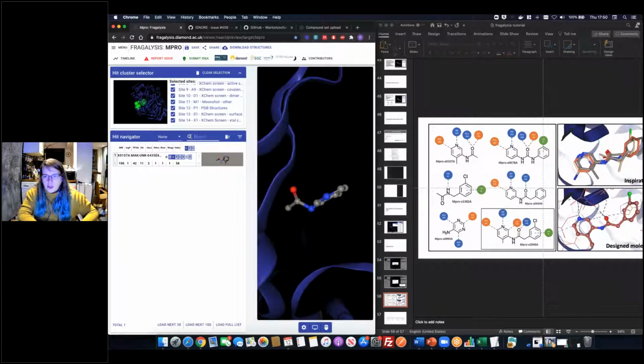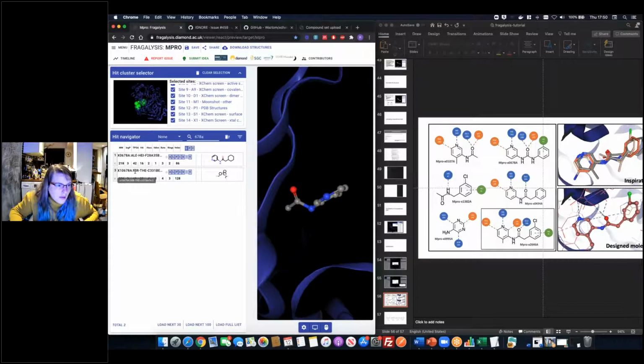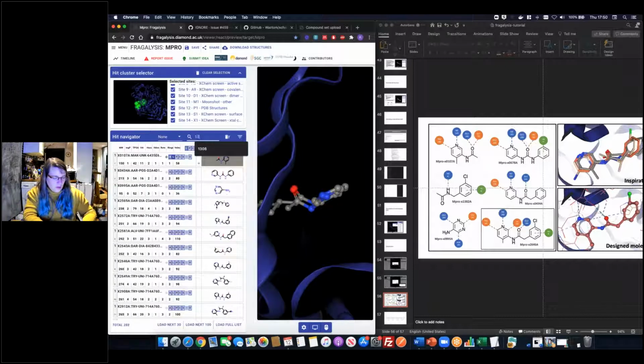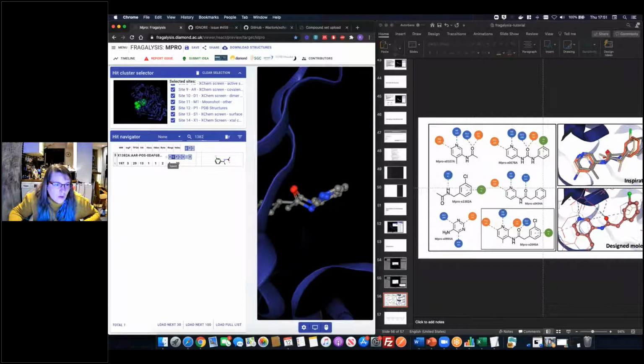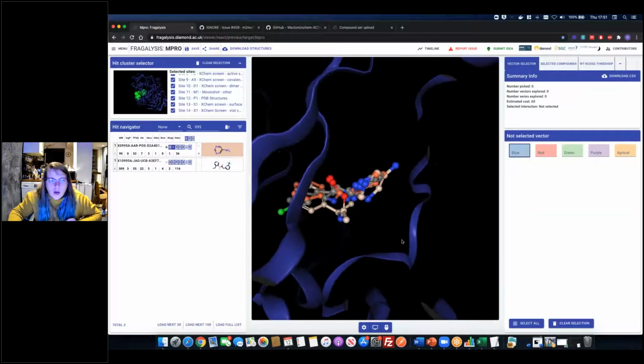Then we can clear the search, turn on 678A. Which one is it? That one, 0678A. Then 1382, for example, 434, and 995. This one.